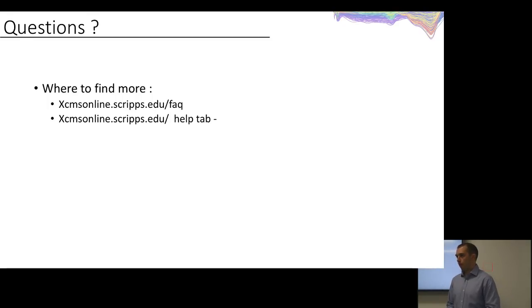We were asked, is the range in binning dependent on the type of instrument? Range in binning. So when you choose your binning sets for parameters, this came up with the peak detection. Sure. Right. So when we're detecting the trace, it is instrument dependent, and we quote it in ppm.